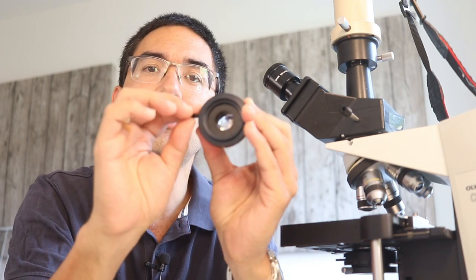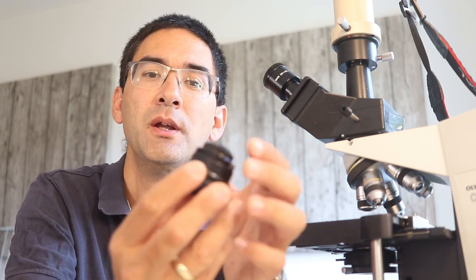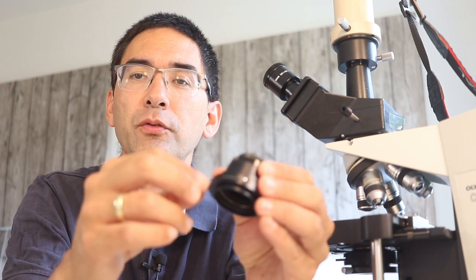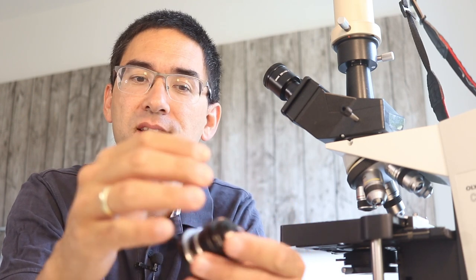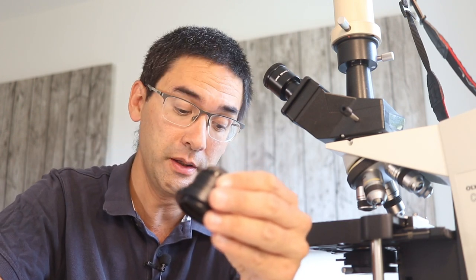Closing the aperture diaphragm might seem like a disadvantage, but you can always increase light intensity again. The benefit is that it's much easier to focus because you have a larger depth of field and the contrast is higher. Move the lever in the direction where the image appears darkest — that's the important thing. Depending on your condenser type, you move it left or right.